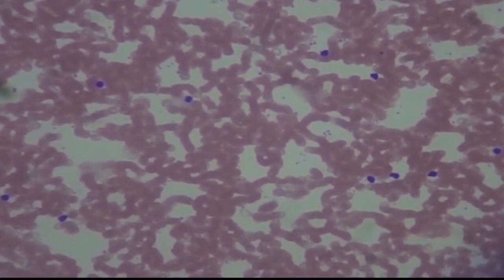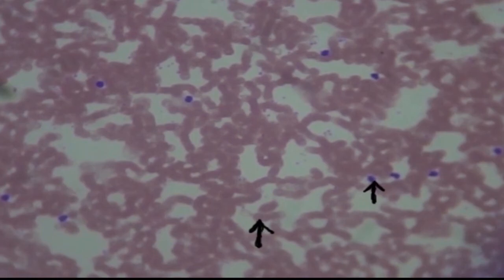Besides the ground substance, there's three other parts to blood that you need to be able to identify. The first one is red blood cells. And red blood cells are easy to identify because at maturity, they get rid of their nucleus. So they don't have any DNA for stains to attach to. So they're never going to stain purple. Unlike the white blood cells or leukocytes that still have their nucleus. So their nucleus will stain a purplish color. And the last structure you will need to identify are platelets, which are these little tiny specks that are floating around in the blood. And platelets are important for clotting.